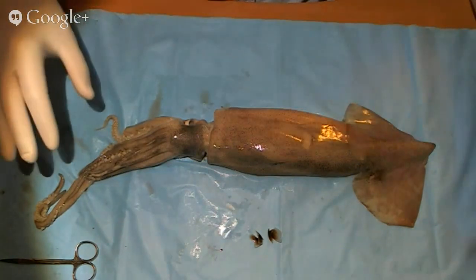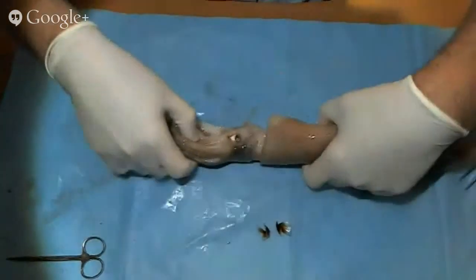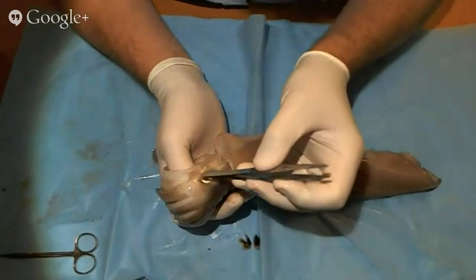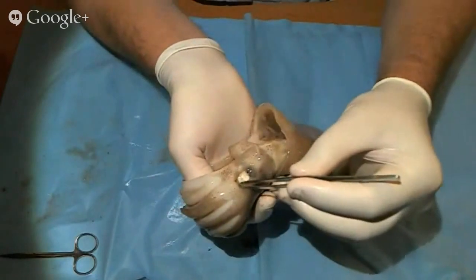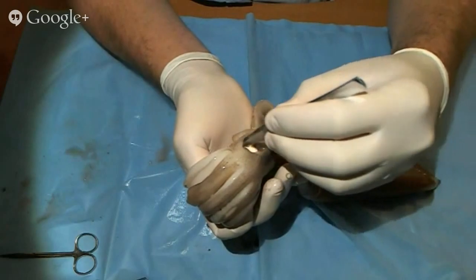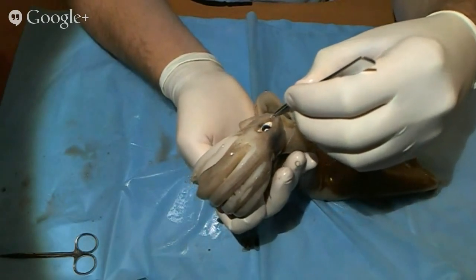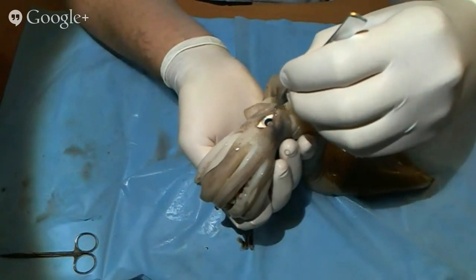One other thing before we go cutting inside the squid here, I want to have the kids look at the eye. If they're looking at the eye, they might notice that there's literally a hole right here in the skin of the head of the squid. And behind it is an entire eyeball. So they can see what looks like, for us, a pupil, and you would even see a lens that's in there.